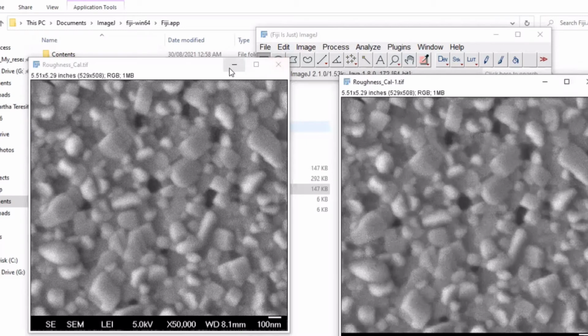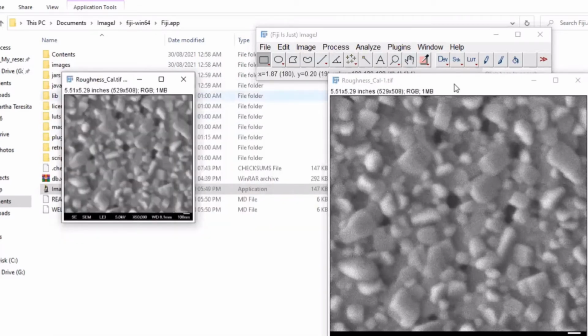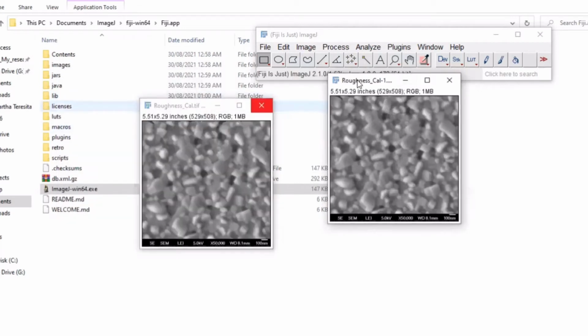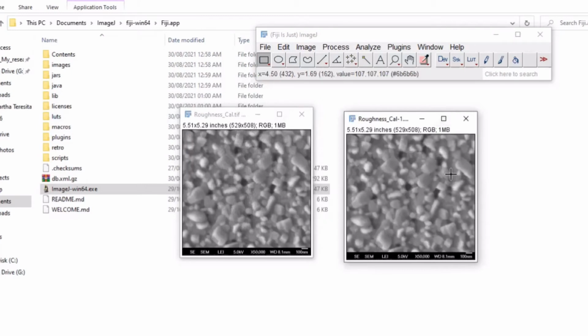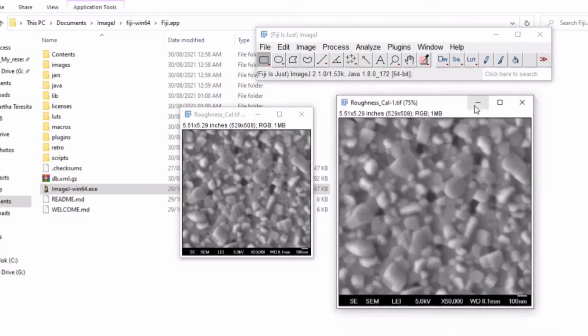I want to create a space here so that I can easily work on it. So click on the image, Control plus minus, Control plus minus. Since this happens to be the image I want to work on, let me zoom a little so that it will be visible.